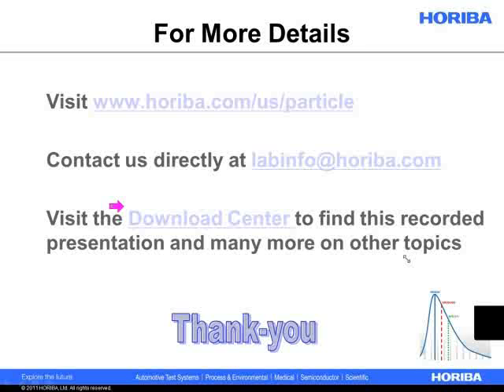But again, whatever error you get in terms of accuracy, a lot of times isn't so significant for people because it still allows them to see changes in product quality and process performance. So let's say you purposely want to create a needle with an aspect ratio of 5:1. If for whatever reason your process changes, so now you're creating needles with an aspect ratio of 3:1, you're still going to see that change in the data. The distribution is still going to get smaller. So in that sense, laser diffraction is a perfectly usable and valuable technique, and in a lot of cases will be faster and a little bit easier to use than other technologies which will actually image the particle.